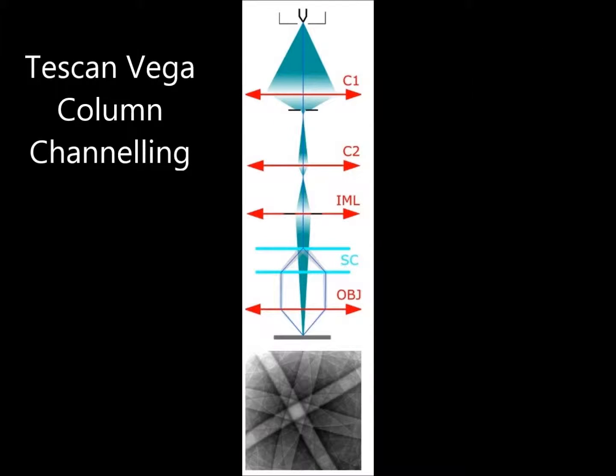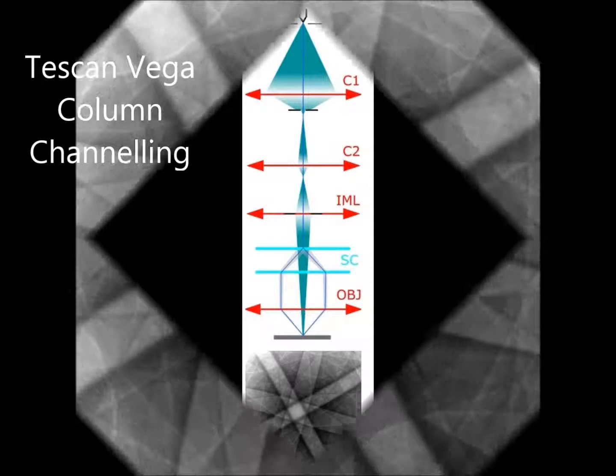Last but not least is channeling mode. In channeling mode, the scanning and the lens focusing are controlled so that the electron beam impinges onto one point of the specimen surface all the time. By means of the scanning of the beam, only the angle of incidence of the beam is changed. The resulting image is the amount of electrons dependent on the impacting beam angle.